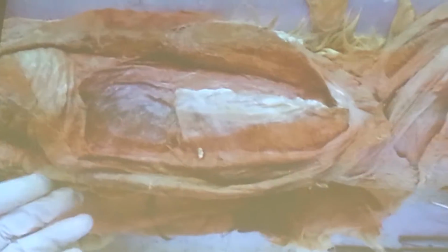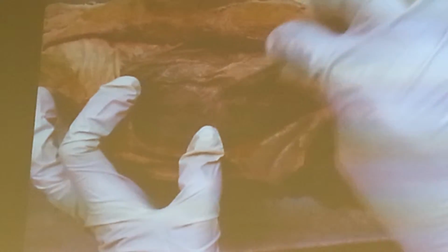So, external, rectus abdominis and internal oblique flexion. I show you at the end, okay? So far it is external oblique, and this is internal oblique, right? And beneath is aponeurosis of internal oblique. If you are able to separate that here, this aponeurosis, because that's very thin, as you see. When you put it away, and if you are able to just separate this one, because it's very difficult to separate this here, you will see the muscles with this direction toward the midline, almost transverse.